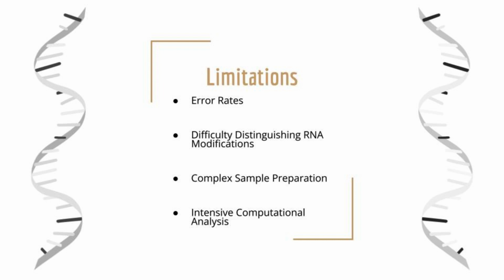The sample preparation can be complex and time-consuming, and analyzing nanopore sequencing data can be computationally intensive, and it requires specialized tools. Handling long-read data and correcting errors can be particularly resource-intensive, and some labs may require significant infrastructure to handle it. But despite these limitations, nanopore technology has made significant strides in addressing many of these issues, and ongoing research and development aim to improve this technology even further.